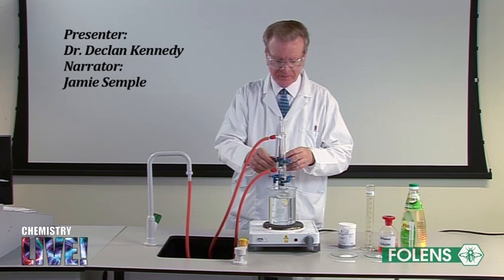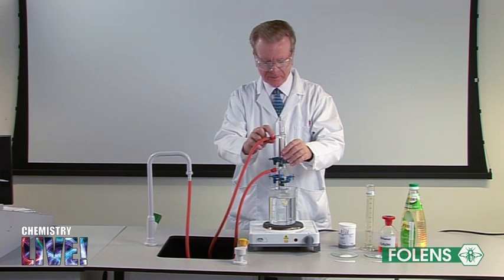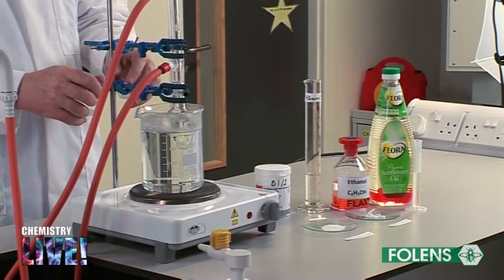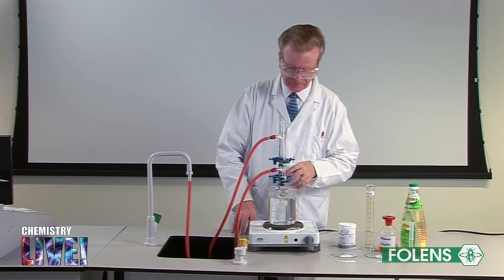Experiment to prepare a sample of soap. The manufacture of soap is one of the oldest chemical reactions known. Soap consists of the salts of long-chained carboxylic acids, for example C17H35COONa, which is commonly called sodium stearate.